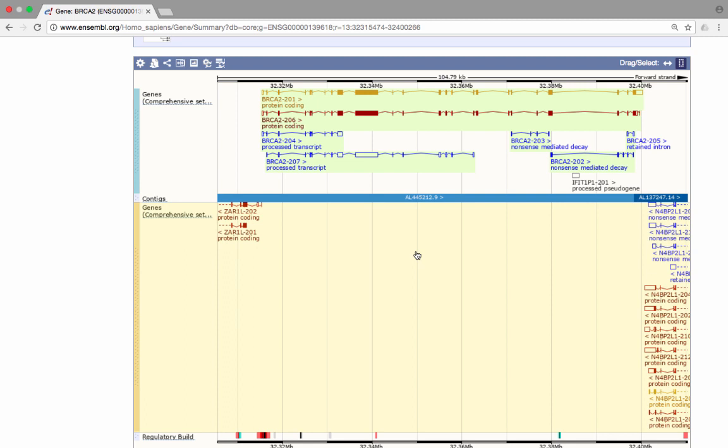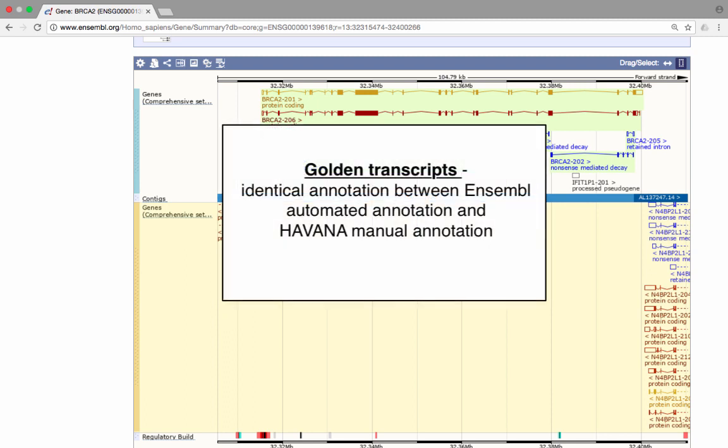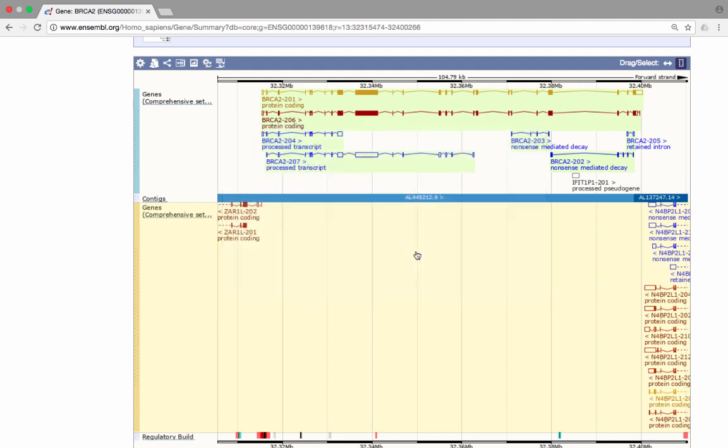The colours of the transcript denote the transcript biotype. One is coloured gold, which denotes that this transcript was annotated by the Ensembl Automated Annotation Pipeline, as well as the manual annotation by the Havana project. The other protein coding transcript, coloured red, was annotated by the Ensembl Automated Annotation Pipeline. The blue transcripts are non-coding process transcripts.